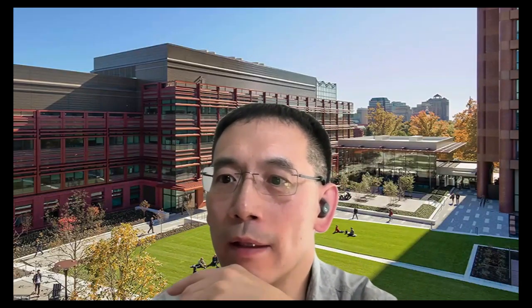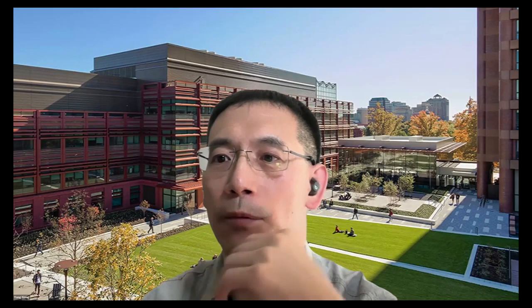Okay, how can the experimenters decide that milling has caused too much damage when working with not so well-known structures? Would a trial and error process be needed? I think, unfortunately, probably yes. But in the end, you will need that if you want to push the frontier. But I think there are enough rules of thumb, right, from everybody's experience on damage.